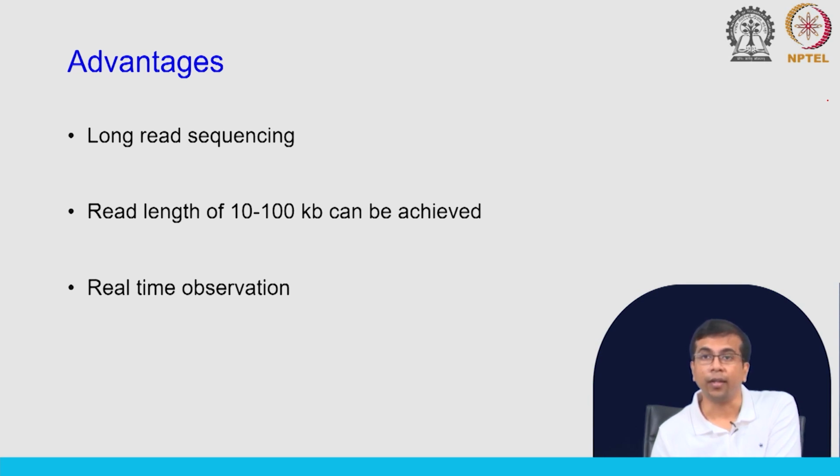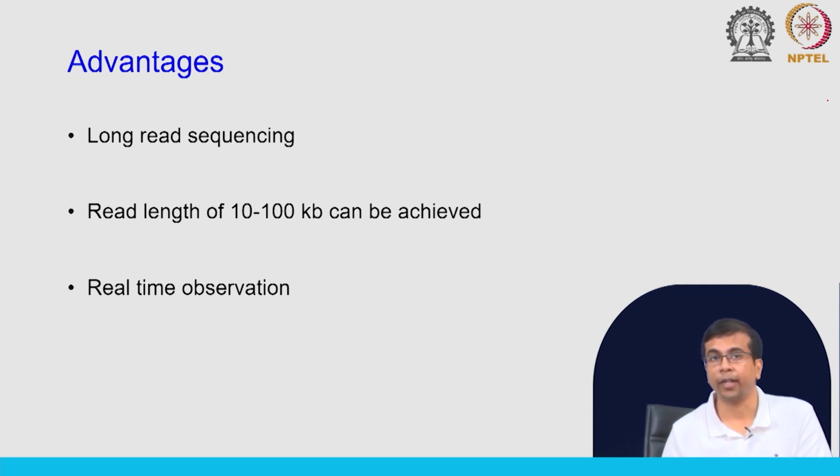Okay. In addition, as you have seen with SMRT, we have real time observation of the change in current that is happening, right, that is the signal, and we have real time observation of what is happening to the current with respect to time, and this data is stored in the data file that comes from Nanopore. So, when we talk about data formats, you will see we have this data in there, and that can be quite useful for specific applications.